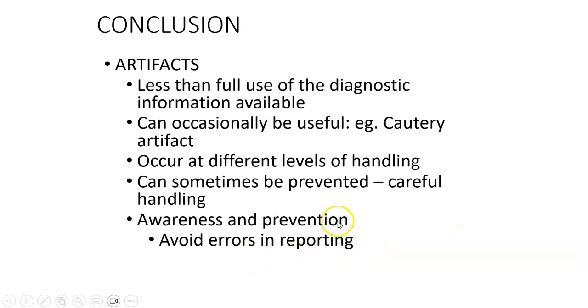And again, I just want to reiterate, certain artifacts, for example, specimen to specimen contamination, can give rise to potentially very serious medical errors and also potentially medical legal incidents. So I would encourage you all to be very observant and be very curious about how specimens are processed and understand every step of processing along the way as you trim specimens, as you handle cases, and also troubleshoot. Thank you.